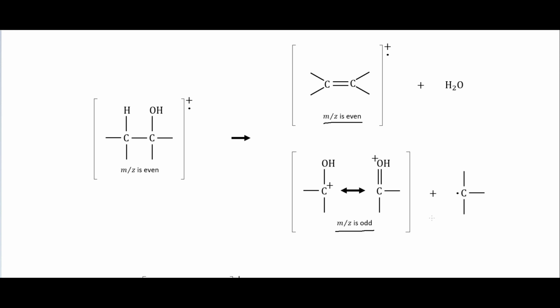And so again, this is one of those things that can be confusing when trying to interpret mass spectra, and one of the reasons why I think the mass spectra can be the most difficult of sort of the triad of organic chemistry measurement instruments. This is just one of those things that you have to try and watch out for. And it's one of the reasons why it can be nice to get a molecular ion, but again, as I said, it's not uncommon to not get the molecular ion.